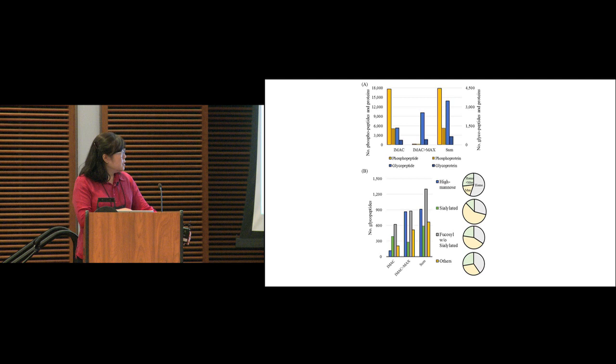So this phenomenon shows that, in the identified glycopeptides, we can look at which proteins or glycoproteins were identified from mouse. We know that in the xenograft tissue, the mouse proteins normally come from the fibroblast or stromal component of the tumor, and the human proteins come from the tumor cancer cells themselves. In this data, we can see that for oligomannose-containing glycopeptides, most come from human, which means most come from the tumor cells themselves. I mean, there is an elevated level of oligomannose in the luminal cell proteins in the xenograft. For sialic acid, most come from mouse proteins, so that's actually from the fibroblast cells. The fucosylated ones are somewhere in the middle, and this is other glycans not containing sialic acid or fucose, which are mostly neutral glycans.